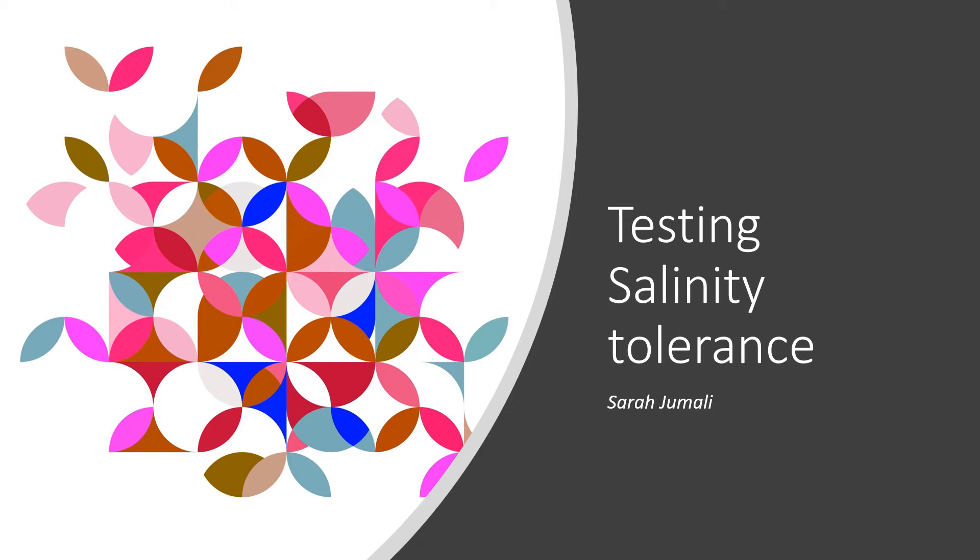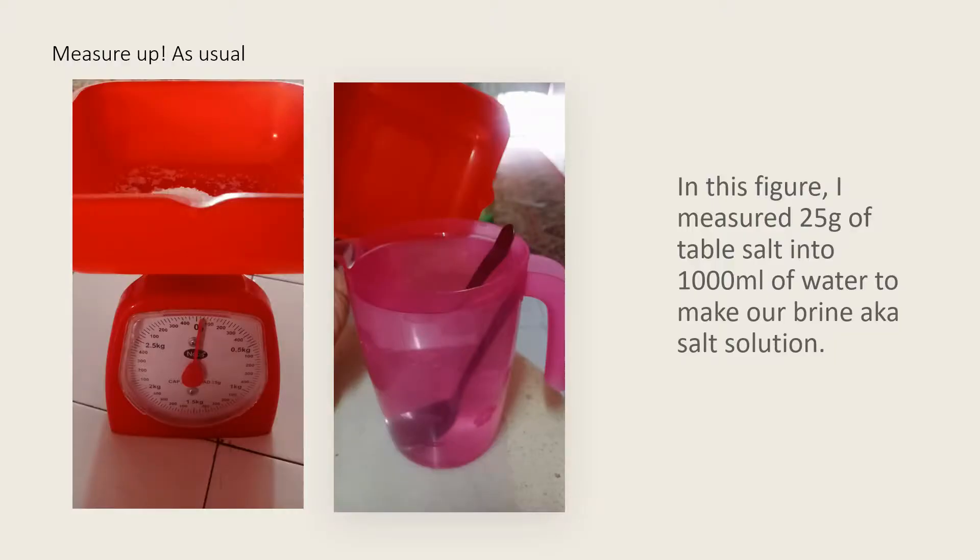For today's lab we're going to test the salinity tolerance of a plant. You can use any choice of plant. The first thing you need to do is measure as usual. Since my weighing scale is not that great, I have just weighed 25 grams of table salt and then poured it into my 1000 milliliter jug which contains 1000 milliliters of water.